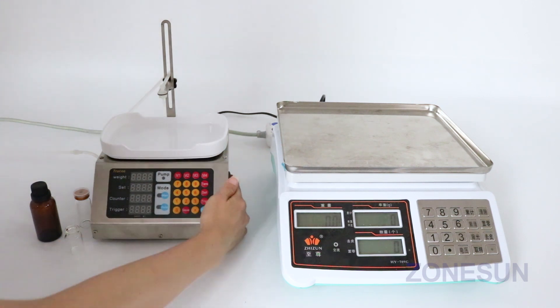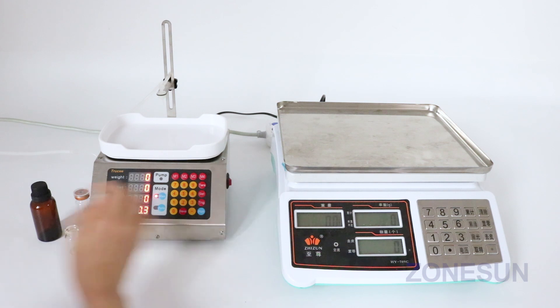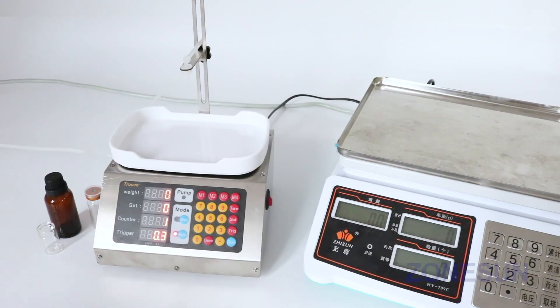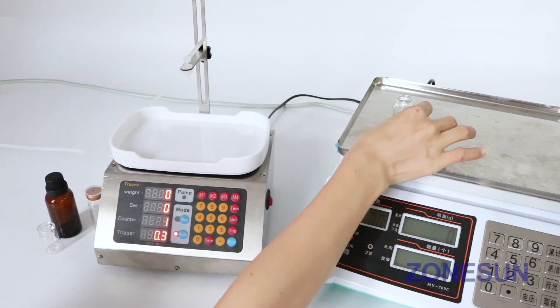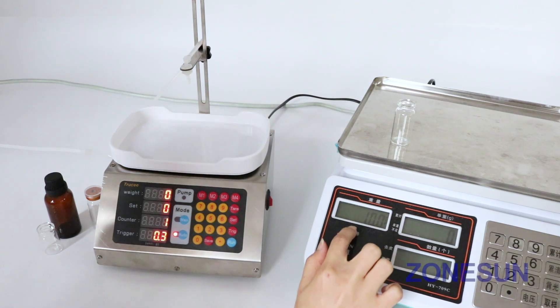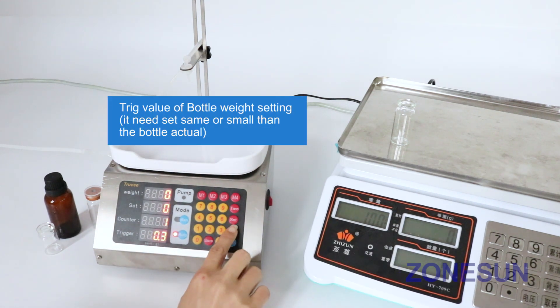Now open the machine. Now, we test the smaller bottle. Weight is 10. The target weight sets 10.